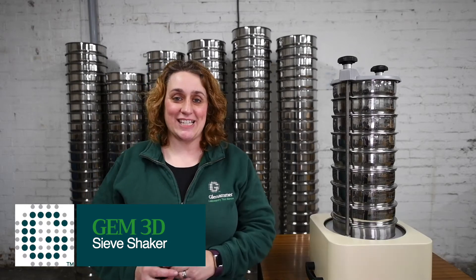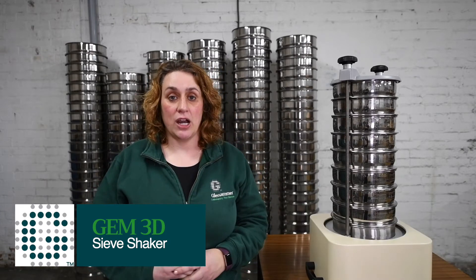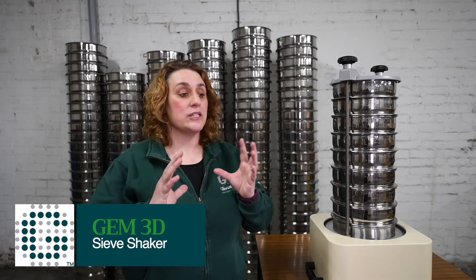As you can see, the stack of sieves is used to separate particles. Glenama have a range of electromagnetic sieve shakers. The 3D basic and advanced shakers have an electromagnetic mechanism that is charged, which springs and releases, pulls and releases to create the 3D movement.